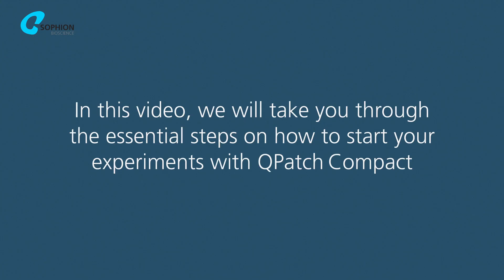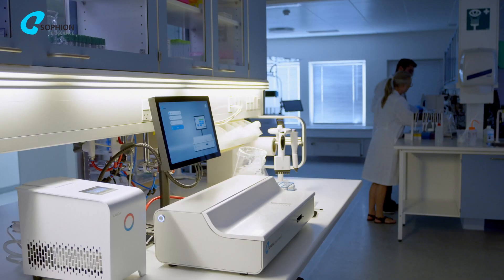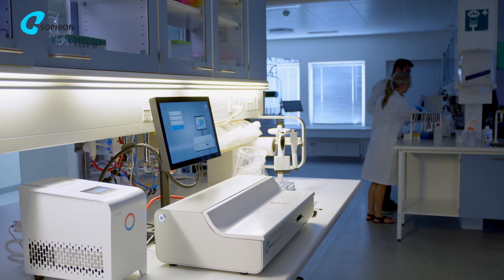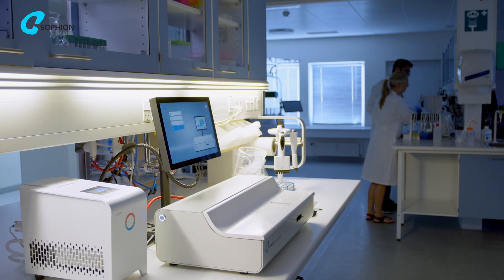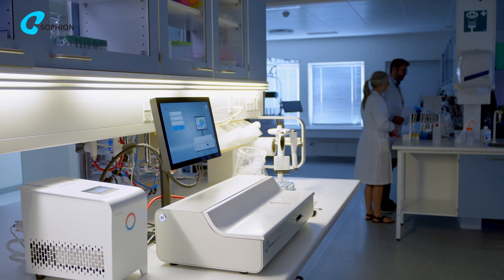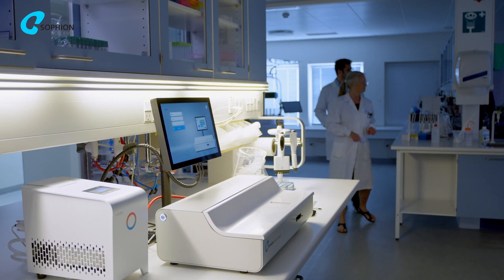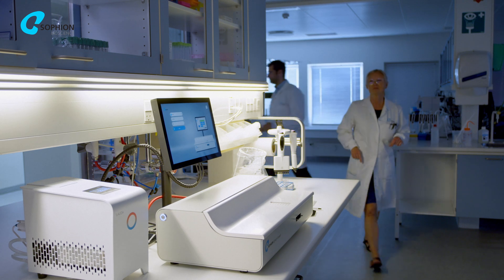In this video, we will take you through the essential steps on how to start your experiments with Qpatch Compact. Before starting any experiments, please consult our guide for the preparation of cells and solutions and optimization of pipetting.